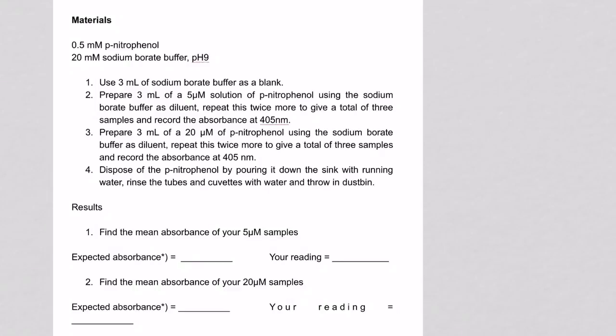People have worked with spectrophotometers before, haven't you? Has anyone worked with specs? Hands up. 1, 2, 3, a few people. Actually, what a spectrophotometer is, it's a light bulb and a photodetector. Now you can imagine if you have a light bulb and there is something in between in the light path that the photodetector will not be as bright as without the thing in it.